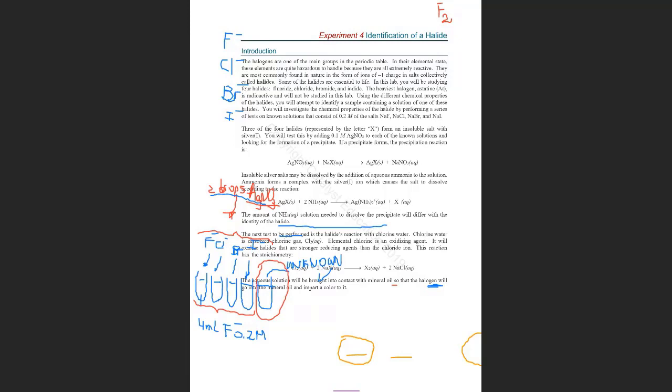You know that oil and water don't mix. They form 2 phases. So you will have one phase of the mineral oil and the aqueous phase. The mineral oil has no color. So you are preparing the sample. So you have your halides, you add the mineral oil.